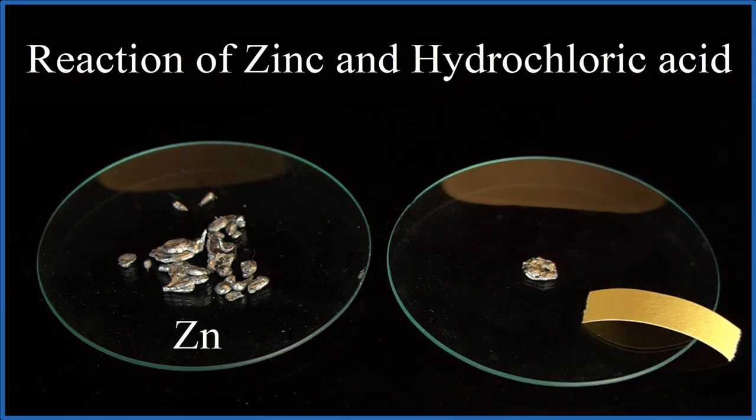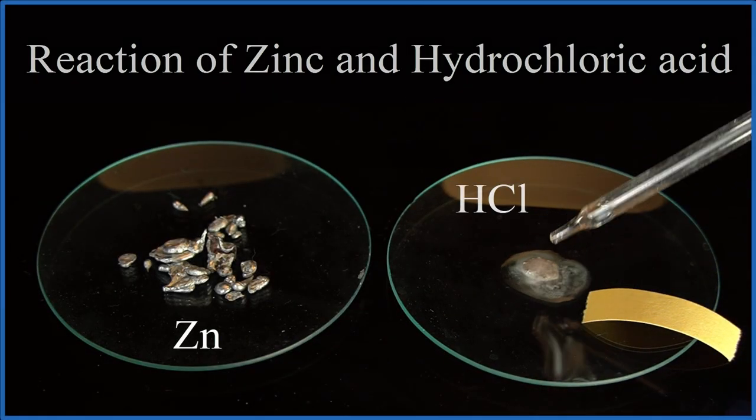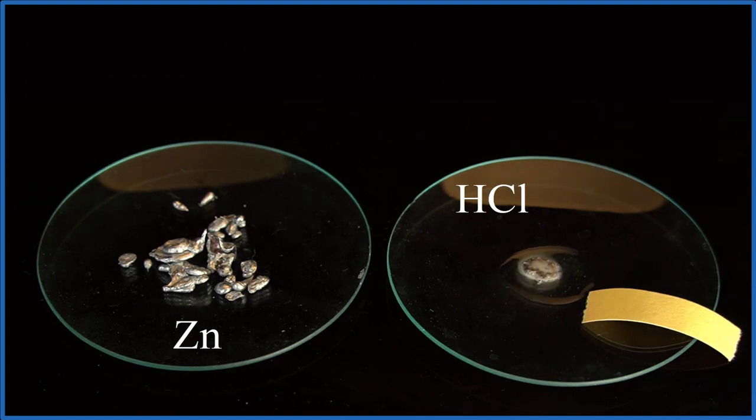So what happens when we put zinc metal in with hydrochloric acid, concentrated hydrochloric acid here?